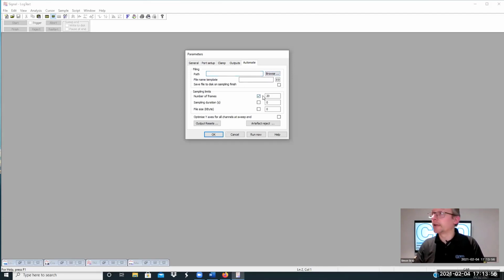You could limit the number of frames that you capture. So you've got 20 repetitions, you've got 20 stimuli delivered. You may always want to repeat a couple that may have failed and automatically save the file as a safety when you stop recording. So at the moment, when you stop and finish, the data isn't actually saved to disk fully.